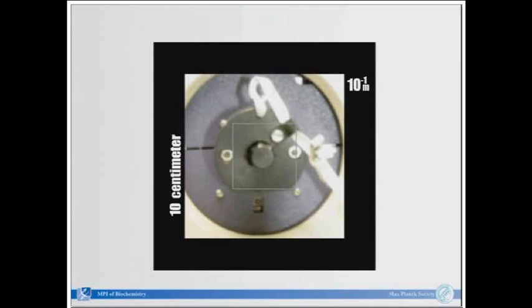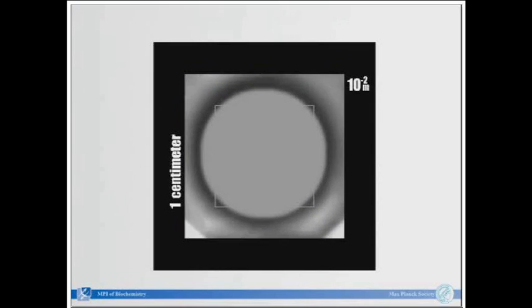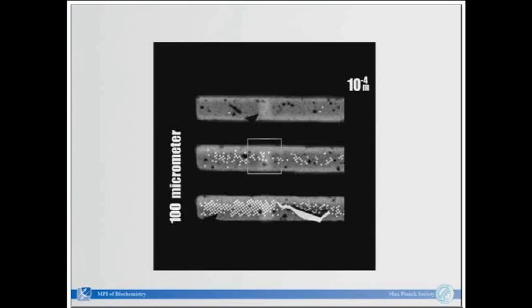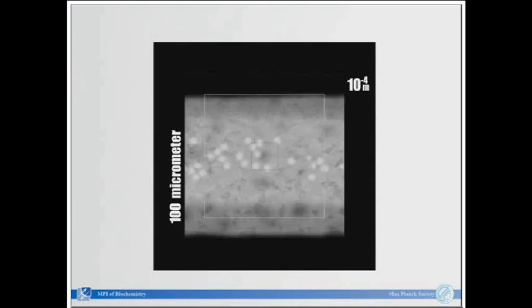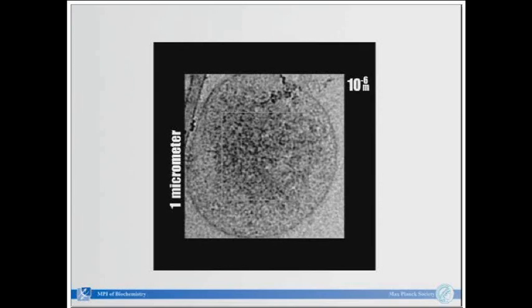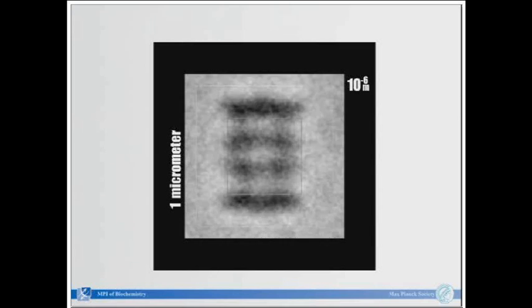So we are entering now the goniometer stage, where in this case you have cartridges to hold your grid, the 3 millimeter disc. In this case, for tomography, it is suitable with long grid bars. And then you see here a vitrified specimen, plunge frozen, with cells on it. Here you can see one cell, and we are approaching now almost the resolution limit we have in tomography. See, that's the cell. And now we would like to depict all the proteins inside the cell.